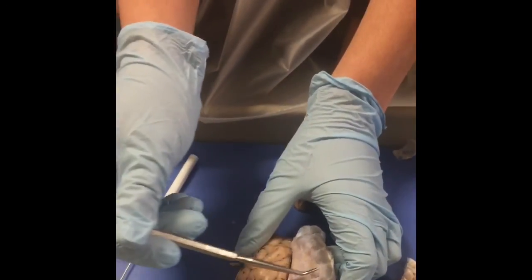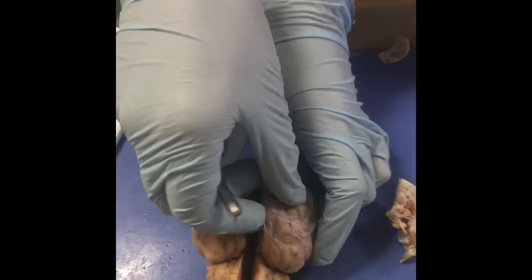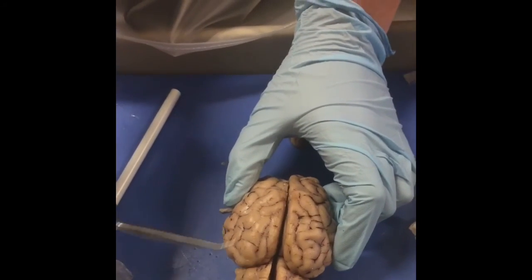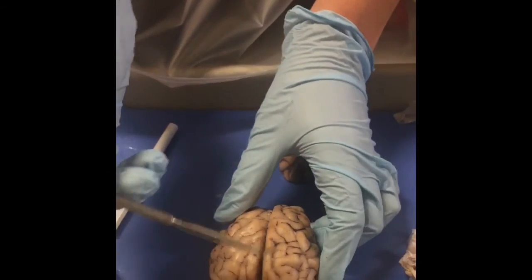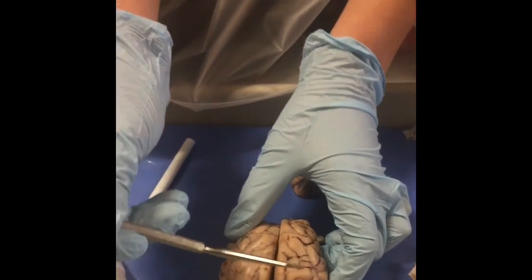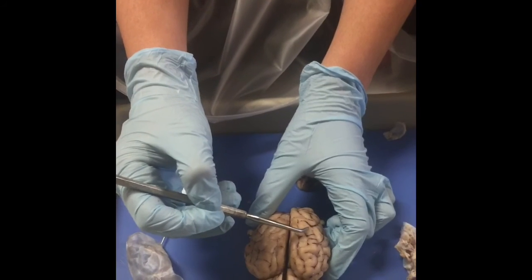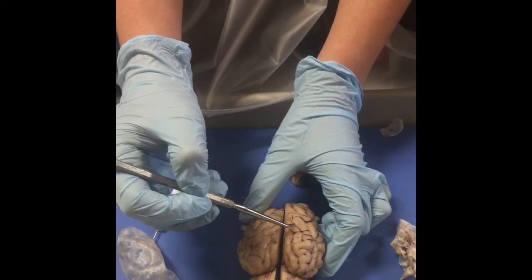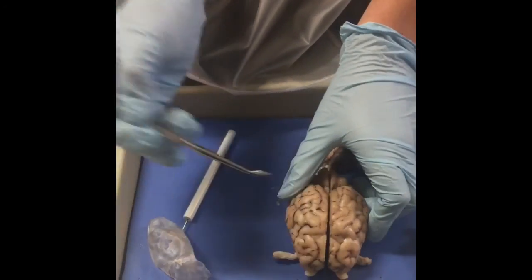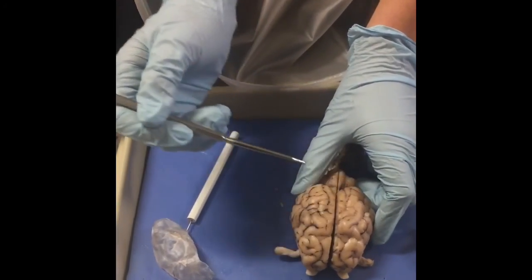Hi, my name is Chloe Larabee, and today I'm going to be dissecting a sheep brain. On the very top of the sheep brain, the first layer is the dura mater, and then once you peel that back, you have the cerebrum and the cerebellum, and on the very top of the cerebrum, we have the outer layer called the cerebral cortex, and these bumpy grooves right here are called gyri, and the shallow grooves here are called the sulci. It is divided into the right and left hemispheres.